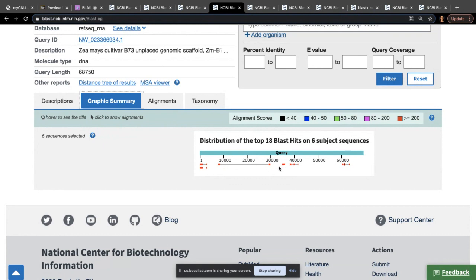So the answer to this one, I count it as 5 genes because I'm looking at how many parts of my genomic sequence here contain genes. And so here there was one mRNA, and this one said it's an mRNA with known protein, but they both match the same chunk. So I'm counting this one as 1.